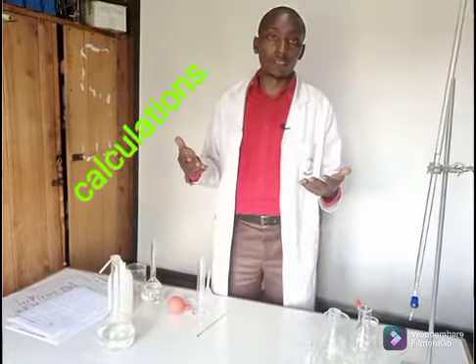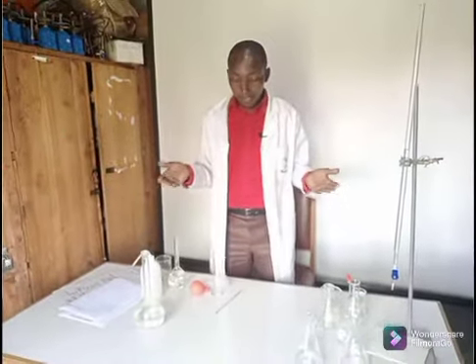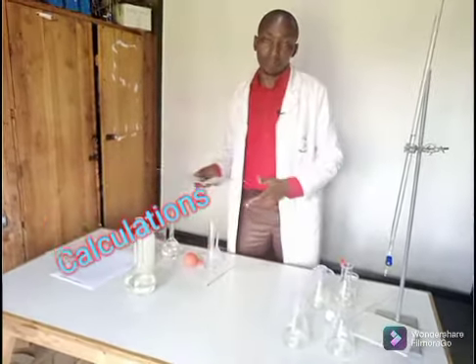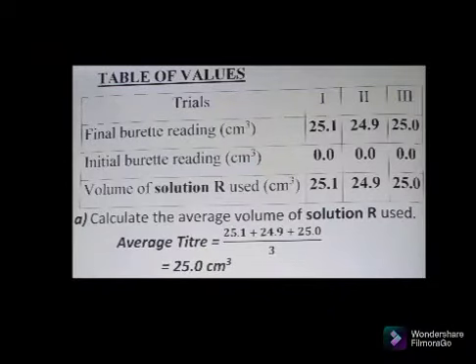Now, because you're done with the practical part, the next section will be to do the calculations. You answer questions based on what exactly you've done. I'm going to show you the questions. Okay, now remember, we go to the calculations.